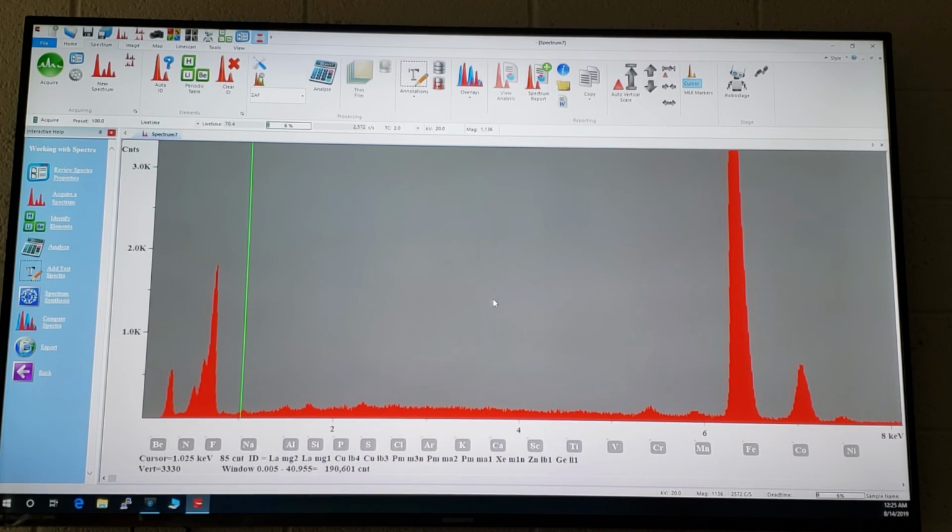Skipping a little bit. My point of this is just to let you know, left clicking your mouse will bring the cursor up. If I decide to kill the cursor, I cannot maneuver my Spectra around with my mouse anymore. Don't worry, we'll get to all these things. I'm just playing the flowchart right now. All I've done was acquire the Spectra. All I did was hit that feature, acquire the Spectra, right? We're over here, right? Acquire the Spectra. And all I did was just let you know, hey, we can throw a cursor up here.